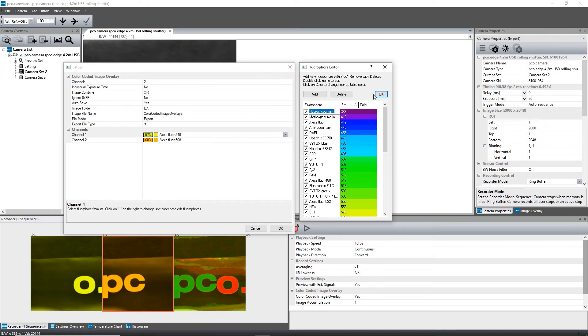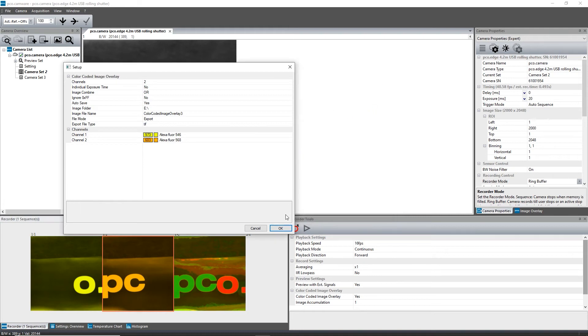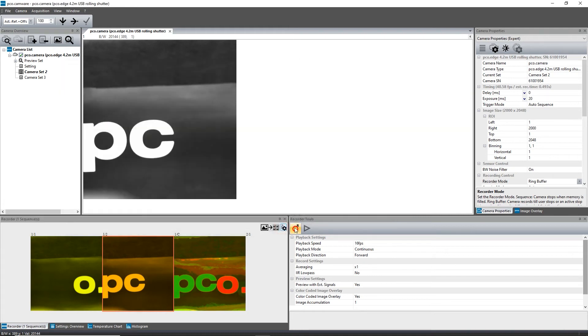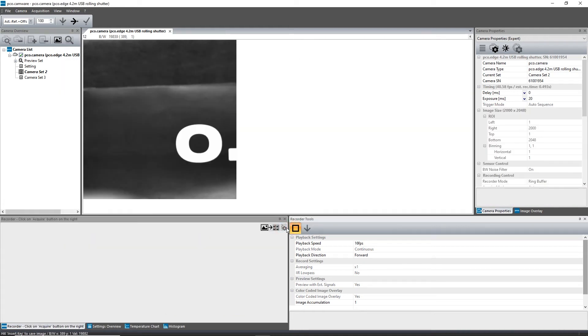The recording is started by clicking on the record button. Now the sequence is ready to capture the first image, which is marked channel 1 in the dataset.